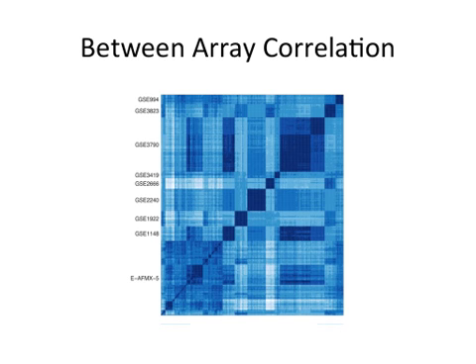So these are several experiments, and they include all kinds of tissues. So the first thing that we see that kind of calls out at us is that everything is blue. There's no white, there's no red. That means every single tissue is correlated with other tissues. And that doesn't make that much sense biologically. There's high correlation in most cases. So it turns out that this is an artifact of something that I'm going to describe today, which is the probe effect.